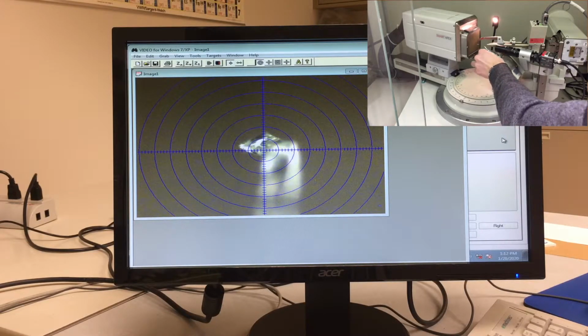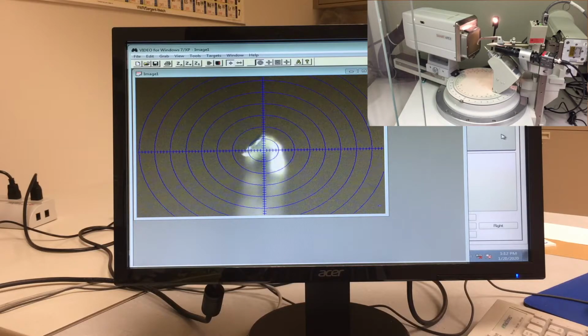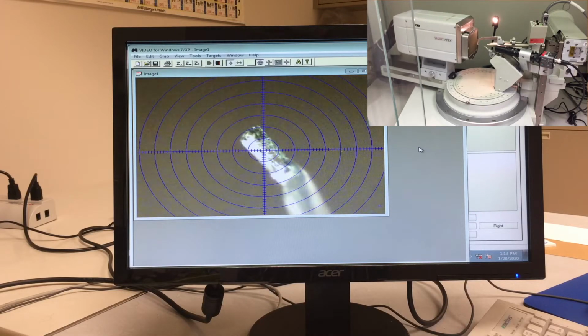But it's not going to be perfect. This is an old instrument. These things kind of vary a little bit over time, but this is pretty solid. Good enough. It doesn't have to be exact, but this is looking pretty good. That's good. And yeah, I'll just go back to the mount position.